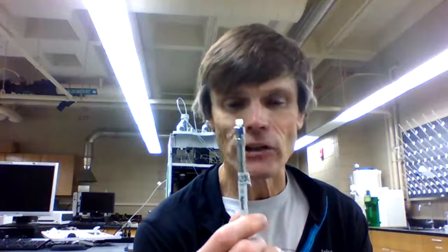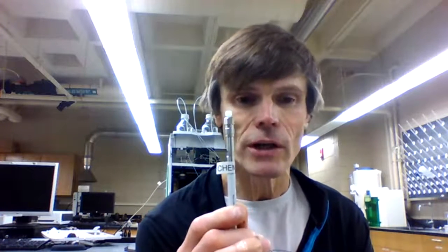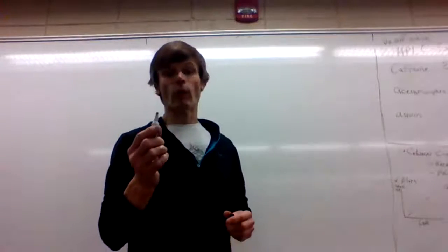So now when we think about the strength of our mobile phase, we can actually encourage the removal of substances better from our column if we change the strength of our mobile phase. I'm going to move over to the dry erase board and talk a little bit about normal phase chromatography real quick. Because the strength of the mobile phase, and you'll hear that term, you need to know what they mean by changing the strength. So let's remember normal phase chromatography.